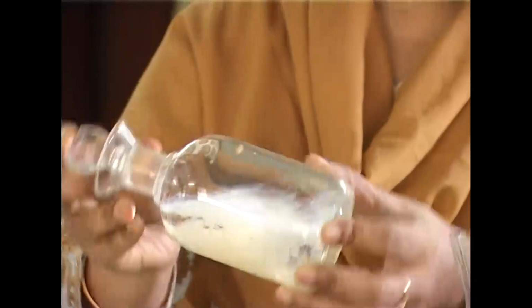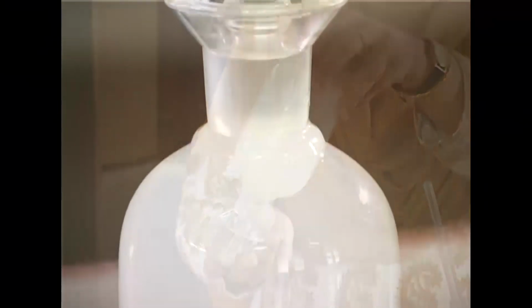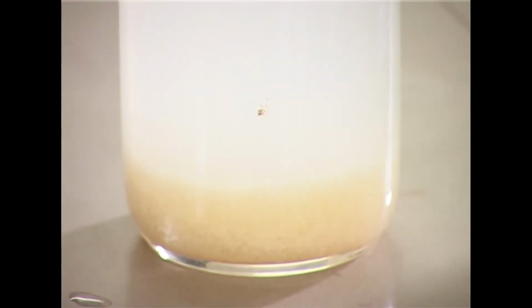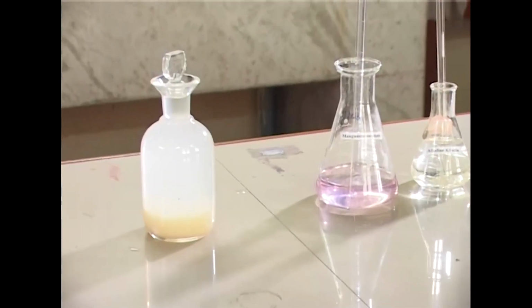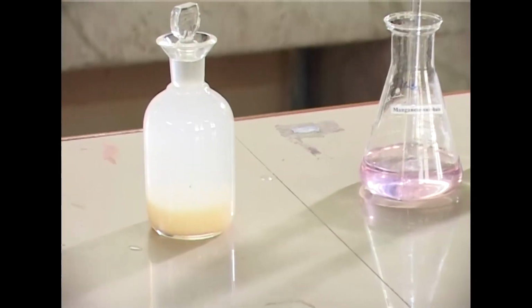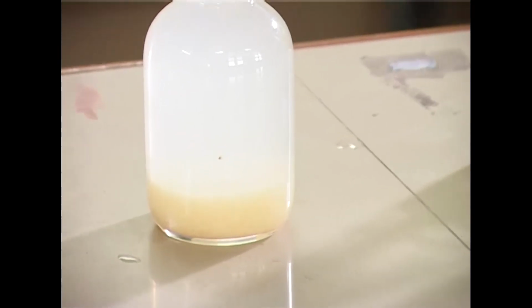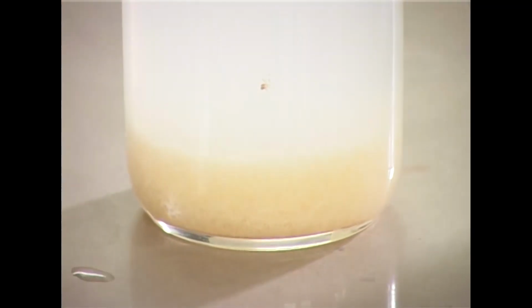Now, after both of these are added, we find a development of a brownish orange precipitate of manganese oxide. That means the oxygen present in the water has reacted with the manganese hydroxide, which was a white precipitate. Therefore, we are not able to see the white precipitate, but we are able to observe the brownish orange precipitate of manganese oxide.